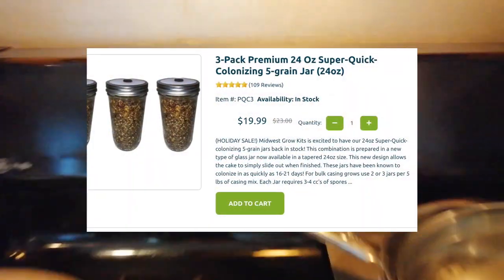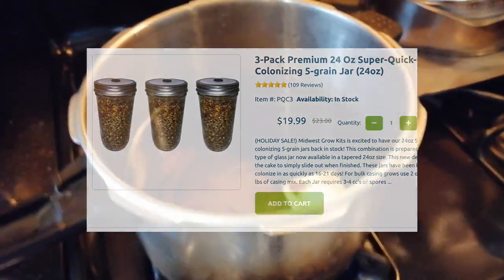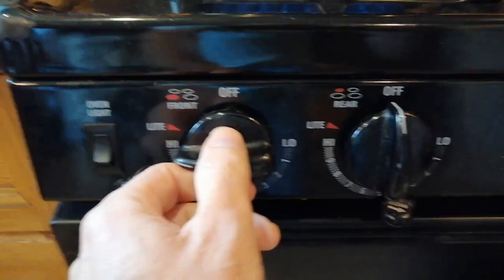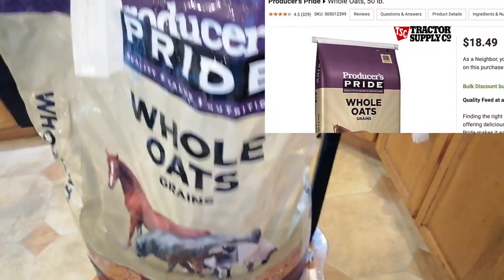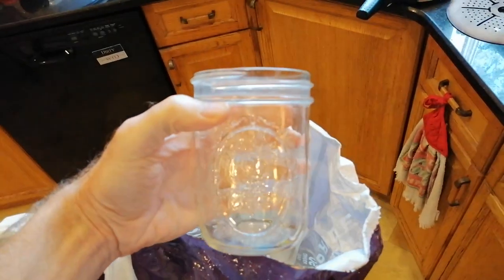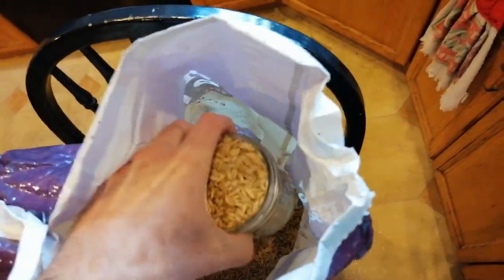To use the spore syringe, you will need sterile grains, which you can either buy or make yourself. If you are going to do it yourself, start by boiling some water in any cooking pot. After it's boiling, turn the burner off. You can use almost any grain, including the cheapest bird seed you can find. But for this video, I'll be using whole oats, which are sold inexpensively as horse food from most farm stores, including Tractor Supply. Figure out how many grain jars you want to make and use one of the jars to measure out one jar full of grain for every two jars that you want to have in the end.